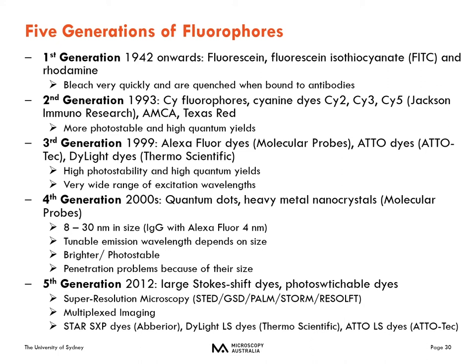In the 2000s, quantum dots and heavy metal nanocrystals began to be used. They do not tend to photobleach and are much brighter, and their emission wavelength is tunable depending on the size. However, penetration is a problem because of their bigger size compared to Alexa Fluor dyes or other organic dyes. In recent years, large Stokes shift dyes or photoswitchable dyes are more popular for super resolution microscopy or multiplex imaging.